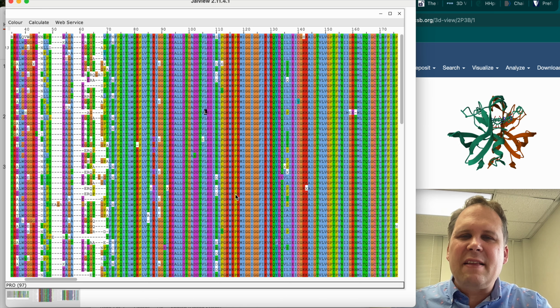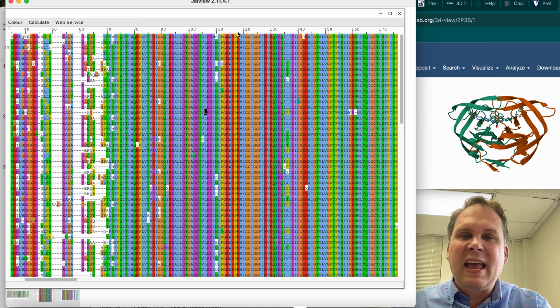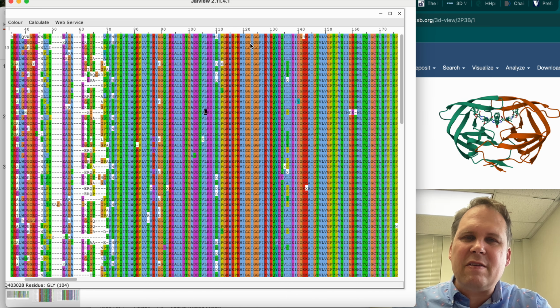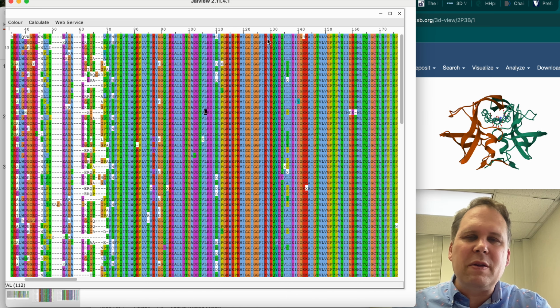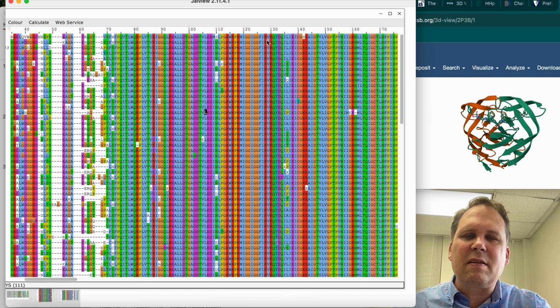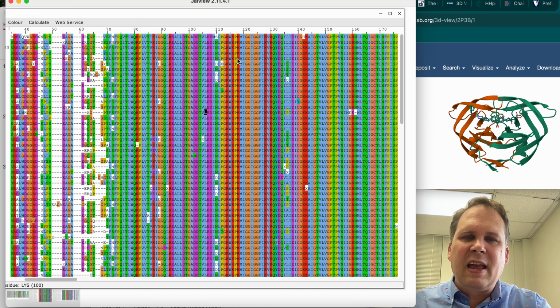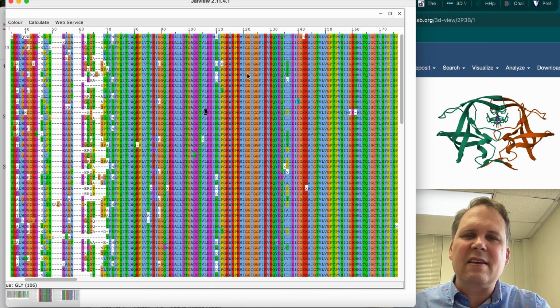All right. And so the things you want to look for here are going to be the substrate binding pocket, and that's going to be these guys right here, sort of flanking this GGI-GG region, and the little amino acids either side of that, which are blue, so those are going to be hydrophobics for the most part, and it's going to be framed by these little basic lysines for the most part, either side, which are the little red columns that you've got over here. And so there you go. That is the active site.